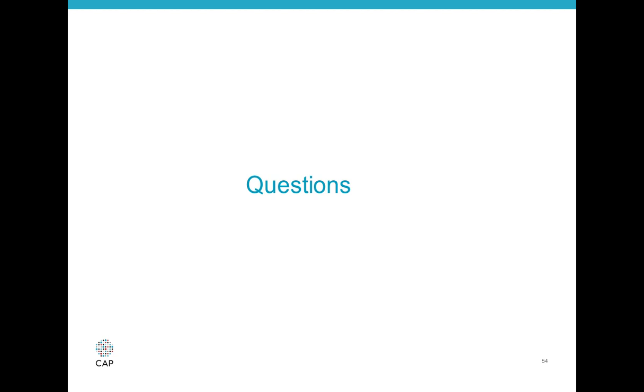Okay, let's get started. Our first question is: is a revalidation of our whole exome sequencing bioinformatics pipeline required if our bioinformatics pipeline is updated to a new version? The short answer is yes.